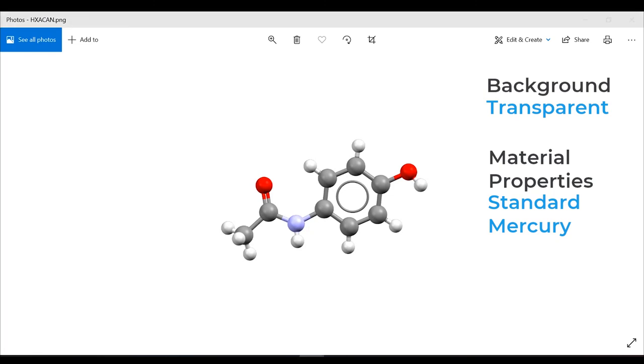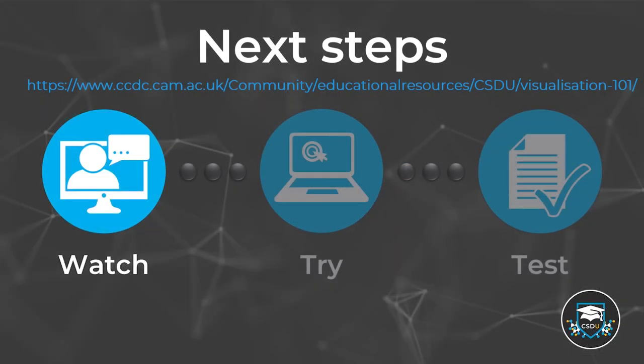This brings me to the end of the demo. I hope you saw the full picture.